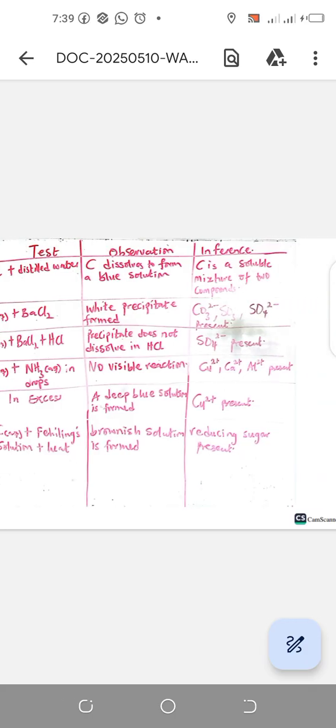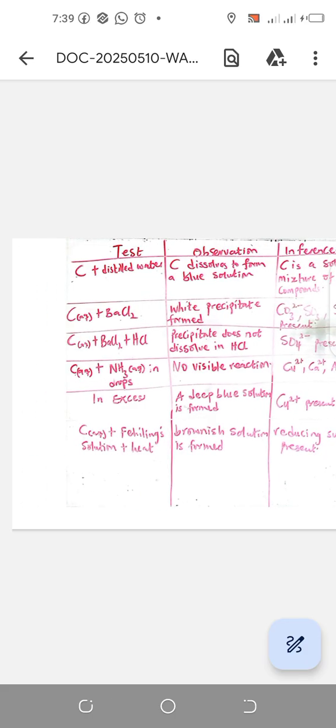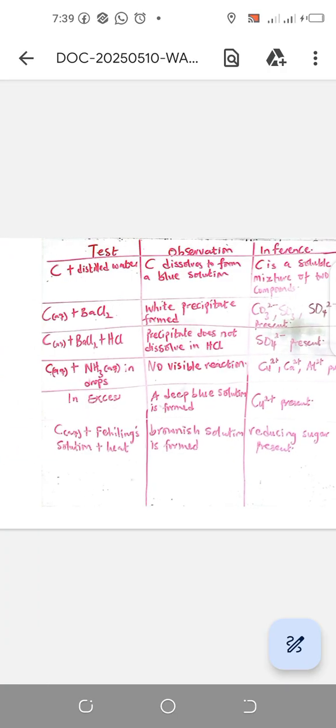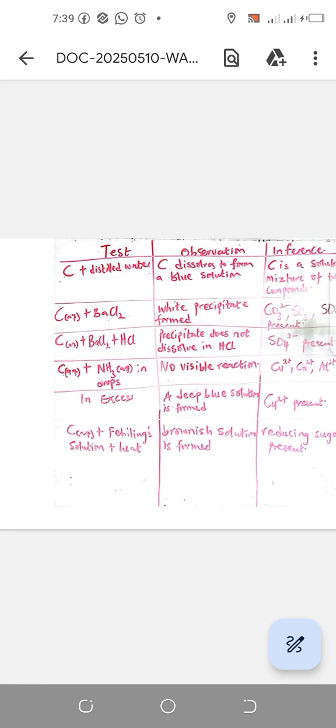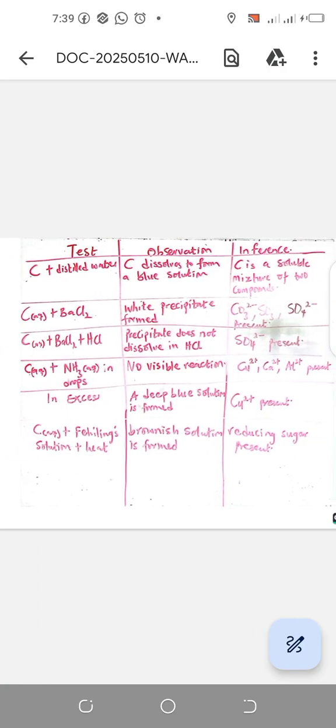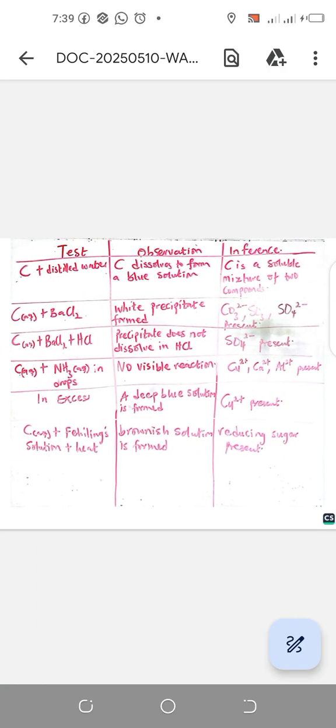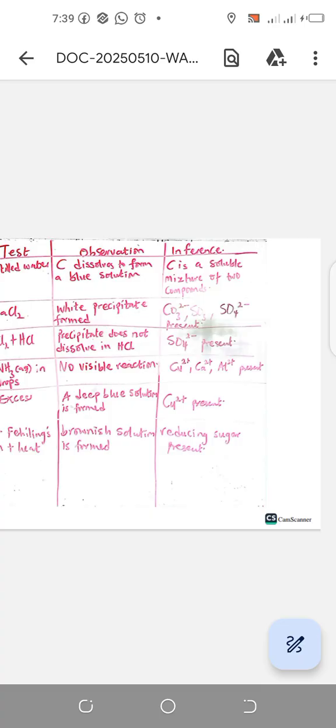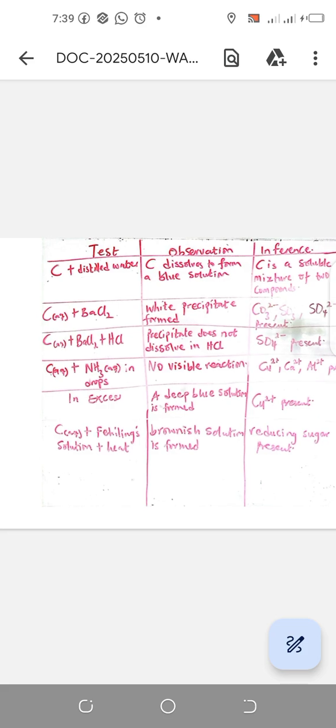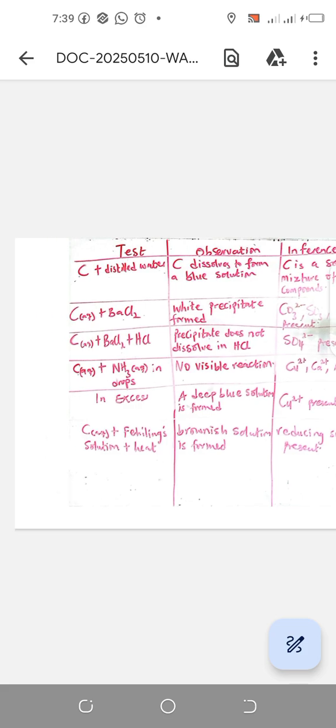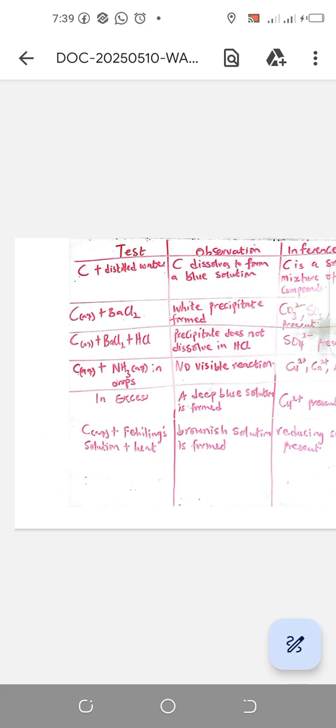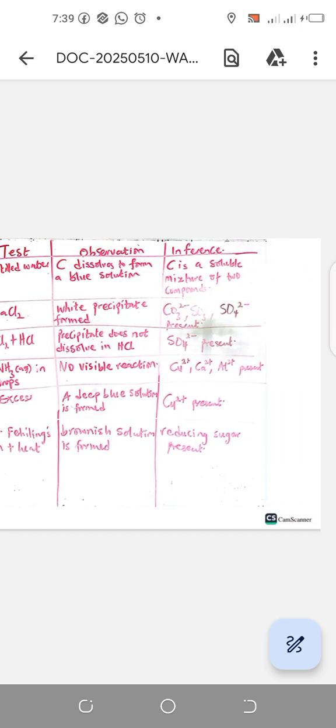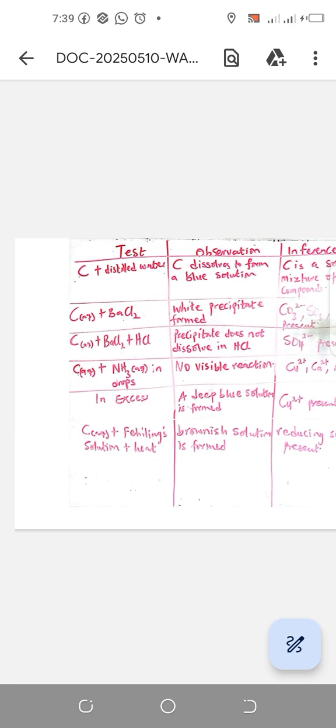We have C plus distilled water. What you would notice is that the whole C will dissolve to form a blue solution. That shows that C is a soluble mixture of two compounds, because you would be having the white and the blue type of substances mixed together.